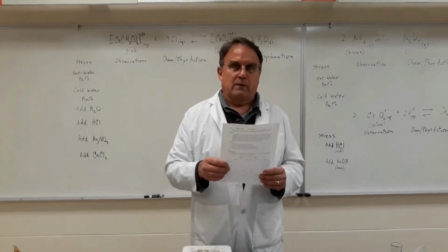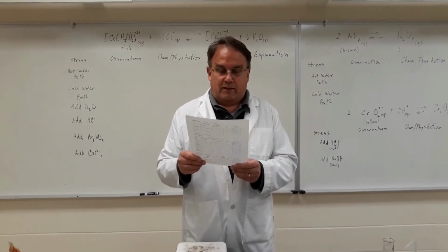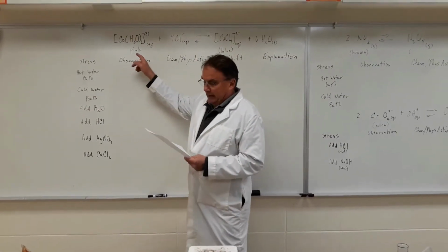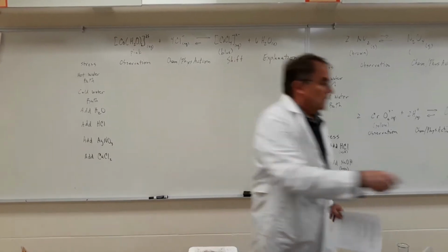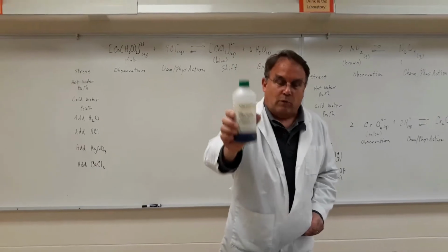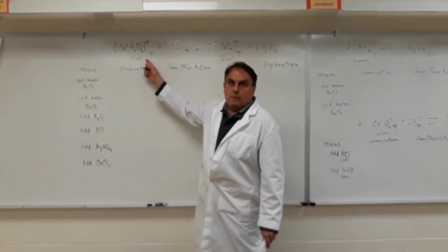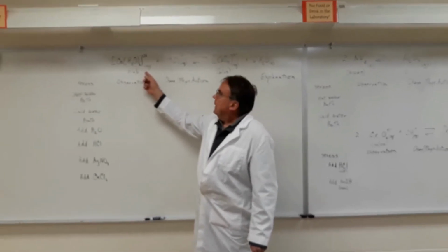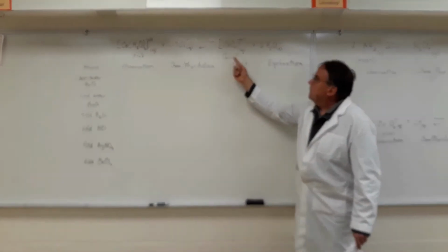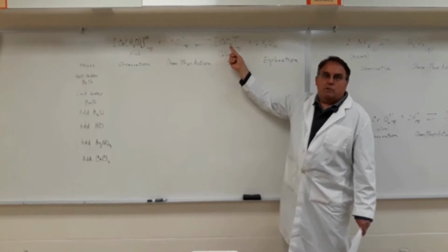Okay, so if you get out your worksheet, you'll see that the first equilibria is a complex one. It's cobalt chloride in solution, which forms a very complex equilibria between this weird Mongo polyatomic ion that's positive and pink, and this complex polyatomic ion, which is negative and blue.